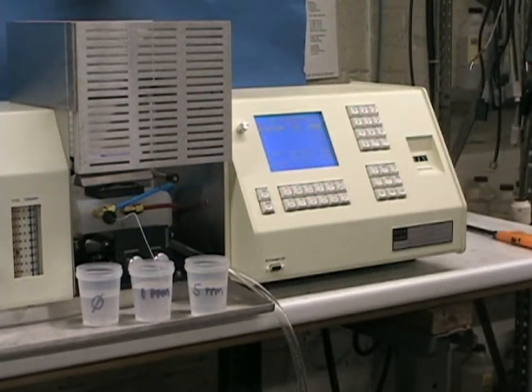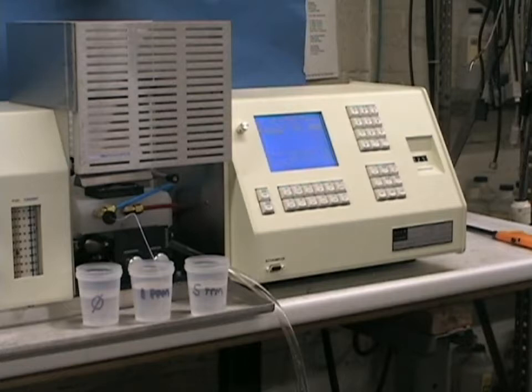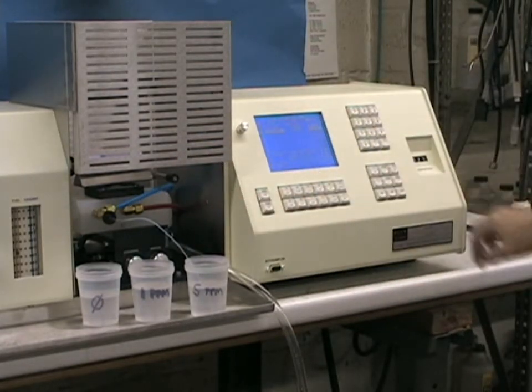In this case, we are taking two readings of each standard, and the average value will be used to calibrate the system, in this case for copper. The data from the calibration can be directed to an ASCII file on a PC, for incorporation in your LIMS software, or the Buck Analyze program, or taken to a printer.